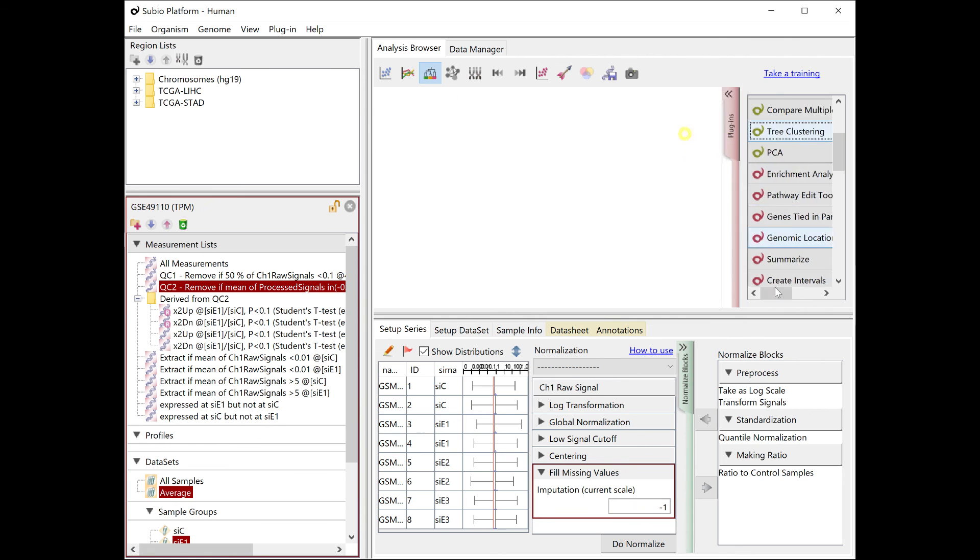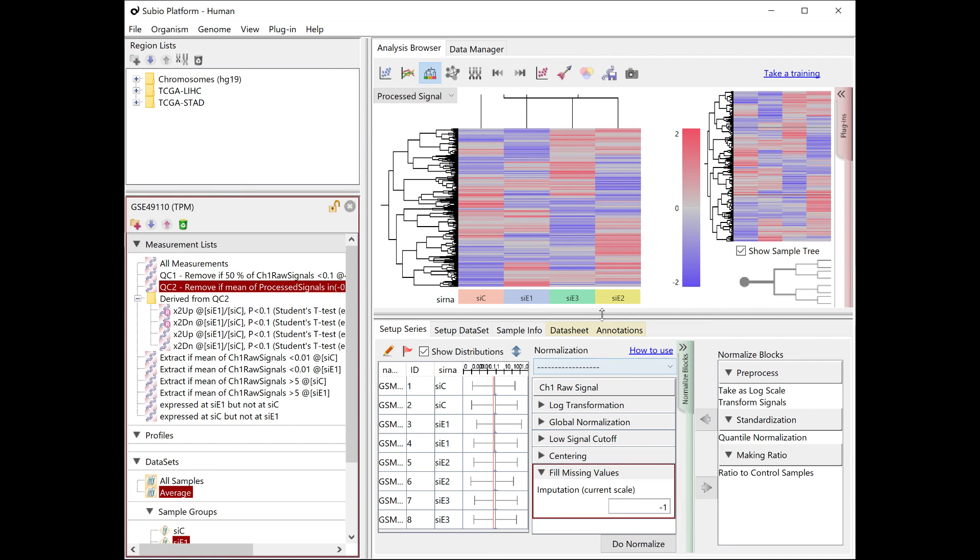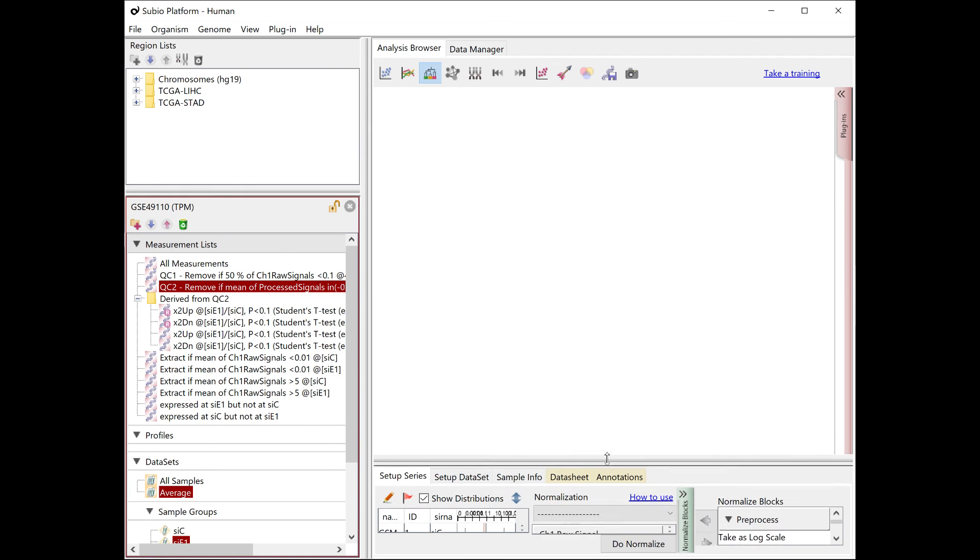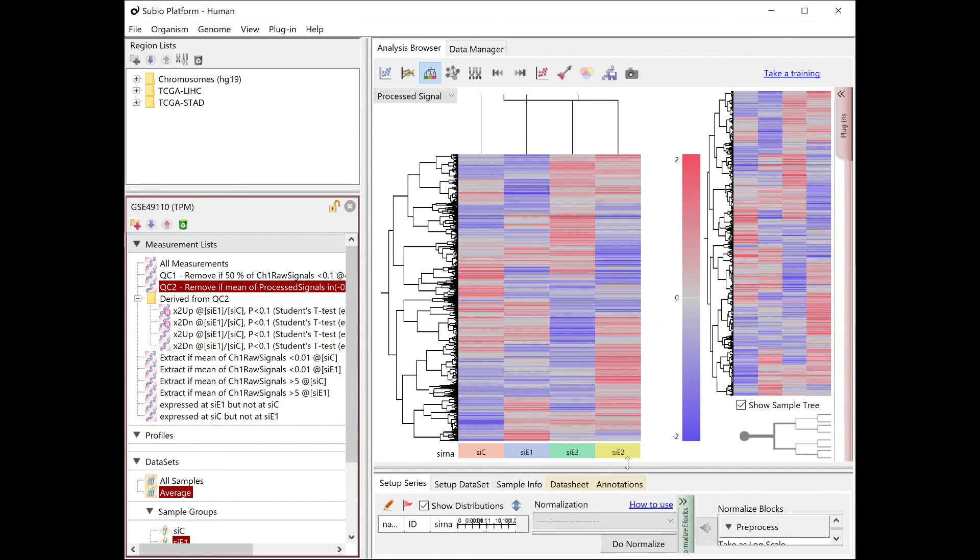Please note, however, that you should not redo the expression difference analysis on this processed signals.